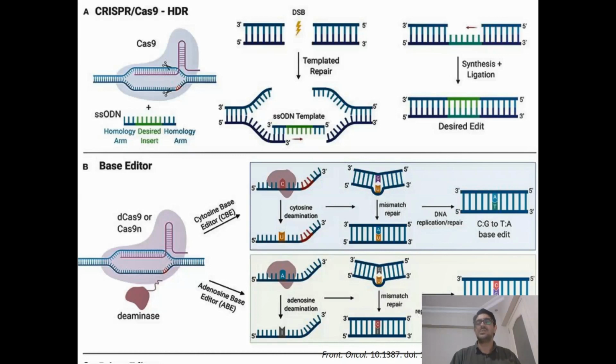However, for the base editor system, you do not need any additional DNA sequence as a reference. With the base editor system, the single guide RNA and the base editor nuclease are enough to edit any targeted sequence. That's why the base editor system still has a great advantage and great modification capacity compared with the classic Cas9 HDR systems.